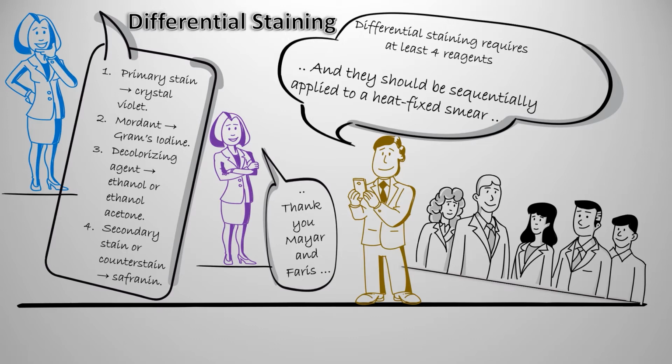And this makes a big difference when decolorizing, because alcohol cannot wash out all the peptidoglycan and thus does not allow the primary stain to be washed out.